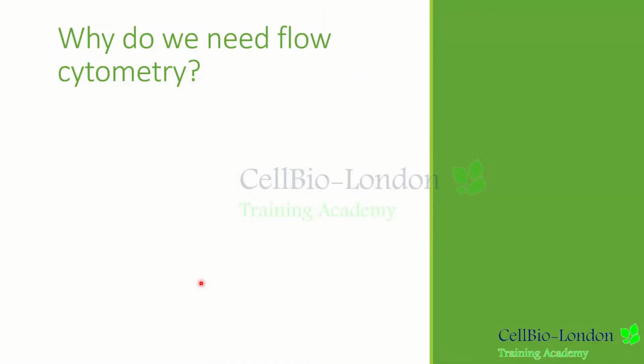So why do we need flow cytometry? A flow cytometry analyzer provides quantifiable data from a sample, in addition to flow cytometry cell sorters, which physically separate and purify certain cell populations of interest based on their optical properties. There are wide applications of flow cytometry.